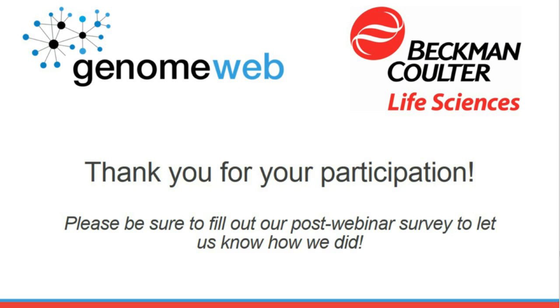We haven't tested for nanopore sequencing, it might have an impact, but when we are talking of DNA fragments, they are very tiny. Even I think we can be able to transfer the actual DNA with one droplet or a few droplets without fragmenting or cutting the DNA into small pieces.